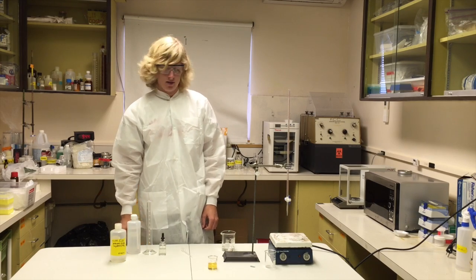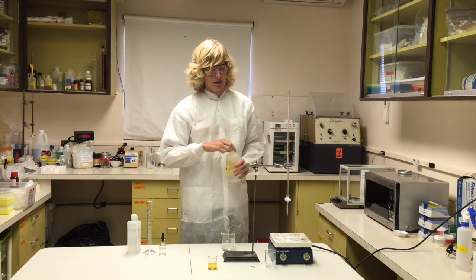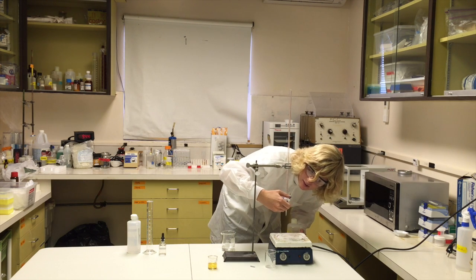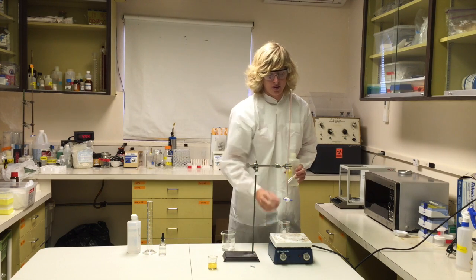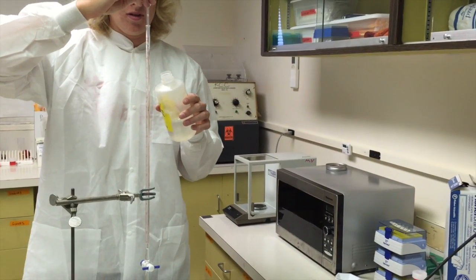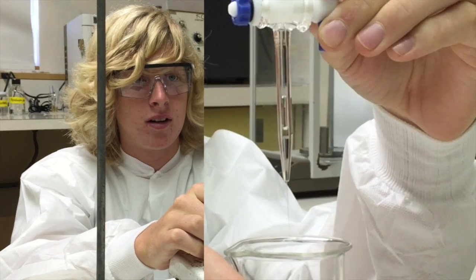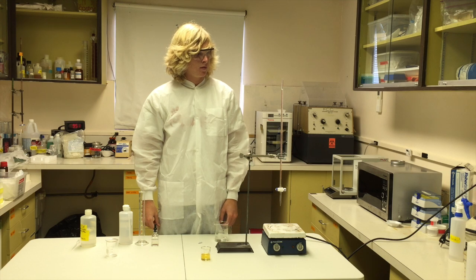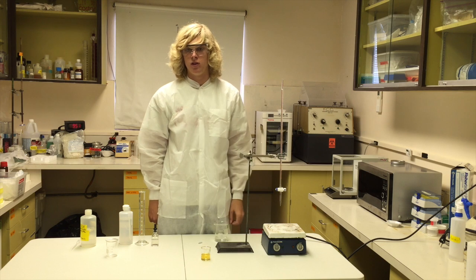So next we're going to add 0.1 normal potassium hydroxide solution inside our burette again. Remember to make sure that the burette is closed before adding any solution to it. It never hurts to put a beaker underneath there, just in case. There we go. Now that the burette is filled up, we took note it's currently all the way full, so we record that as 0.